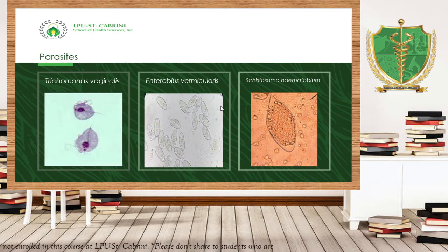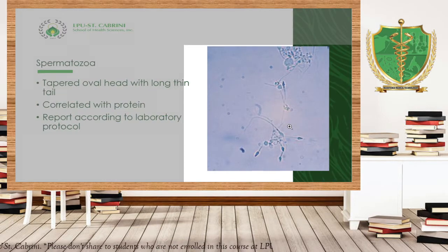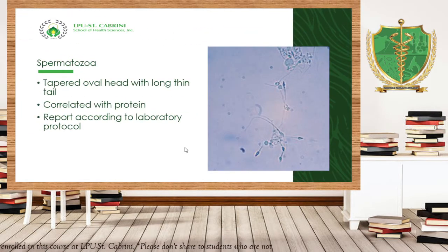May terminal spine. Okay? Spermatozoa, so this is the structure, or how the sperm looks like under the microscope. Well, don't worry, we'll have the experiment on this so that you will be able to know how it looks like. So that is the sperm, no? Remember guys that the presence of sperm in the urine should be reported based on the laboratory protocol. Okay? Well, of course, for a single young female na mayroong presence ng sperm should be reported, because for medico-legal instances, or baka po siya ay victim ng rape.